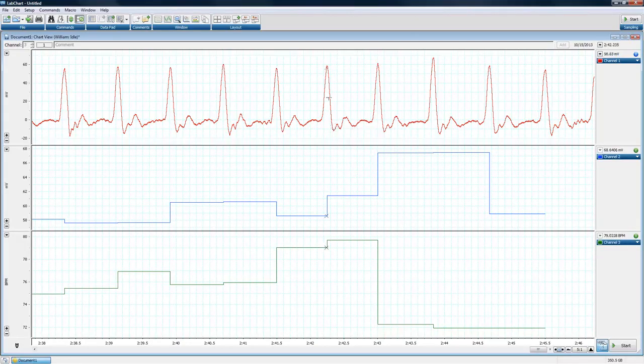Another option we have, of course, I've shown you a couple of these already, but if I right-click in the channels, I have a couple of options here. First one is, we already talked about equalize channel heights. We can auto-scale the data, of course. We can add a comment. We can set the marker. The marker is something I'll talk about here in a minute. Show points as dots changes the way things are looking. But the important one here is really the guidelines. If I click on the guidelines, I'm going to do this in channel 2. I think is where they're probably most useful.